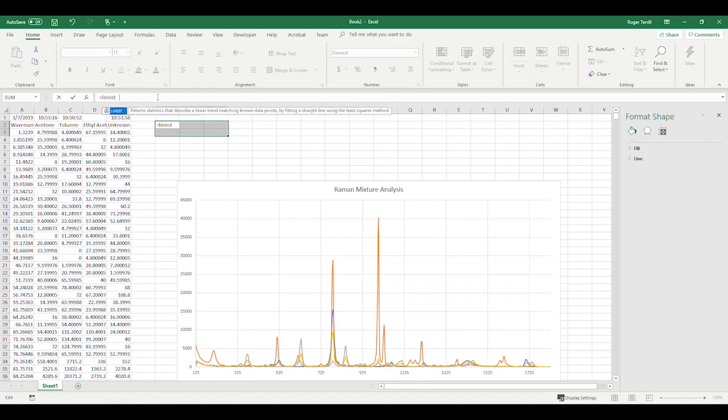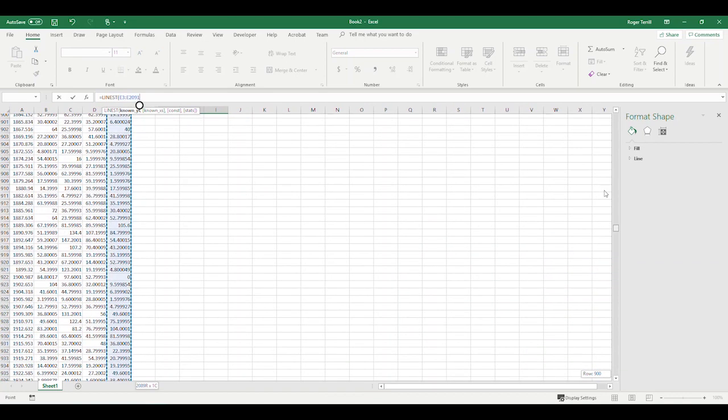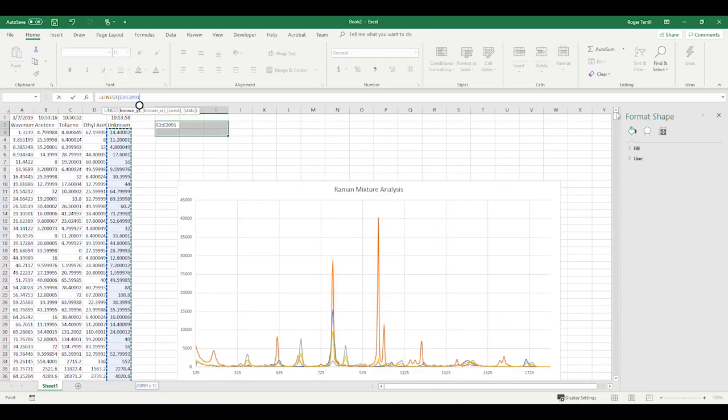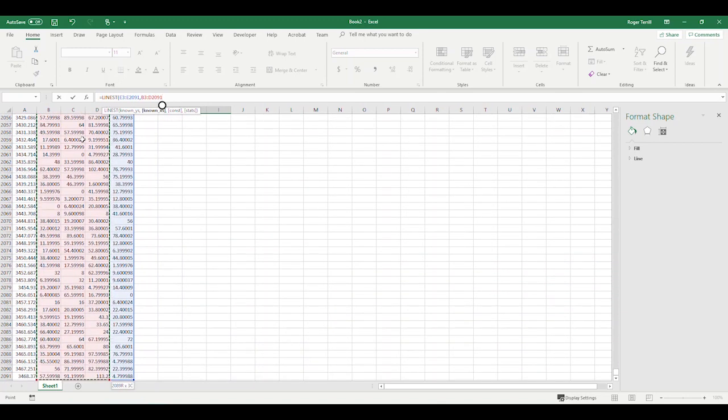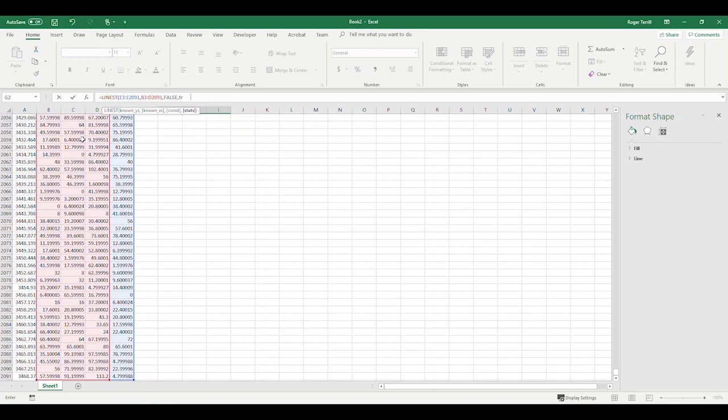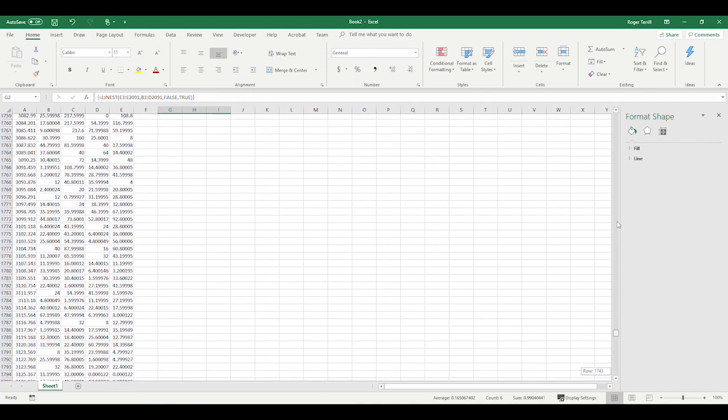So I don't actually want additional statistics on this. So I'm just going to get the coefficients and the uncertainties here. That's going to be coefficients and uncertainties. And they're actually going to come back at us acetone, ethyl acetate, and toluene. So watch carefully. Equals lin-est, the y value is going to be the unknown. And I do shift, control, arrow down there from the top. I'm going to put a comma. Now the x values are going to be the acetone, toluene, and ethyl acetate columns. Now x, in this case, does not involve wave numbers. X is what you multiply the coefficients by. So I highlighted the top row, and now I'm going to go shift, control, arrow down. Now I'm going to say false and true because I actually want the uncertainty in the coefficients here. So shift, control, enter.